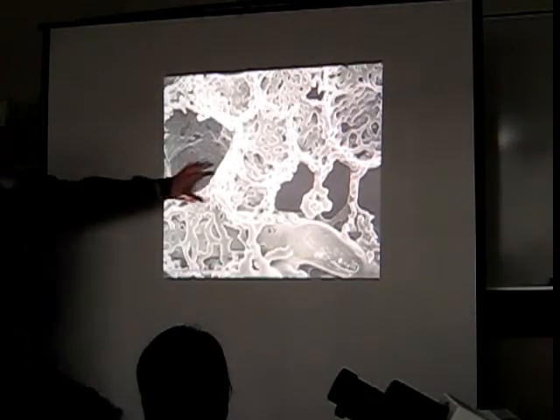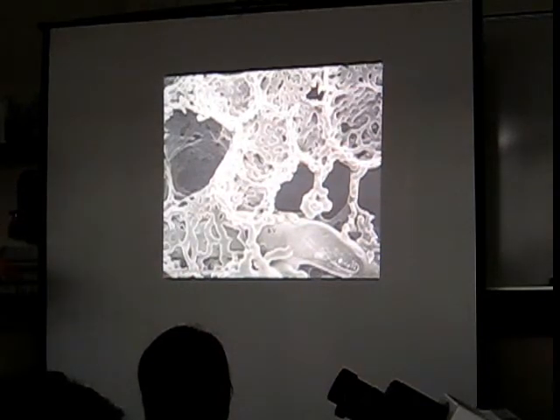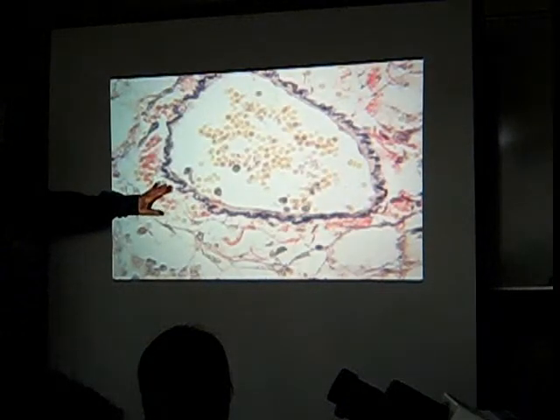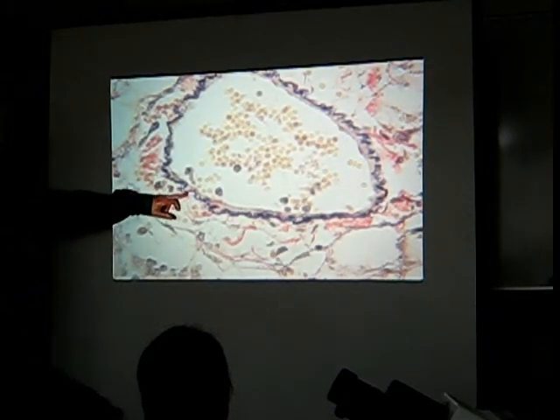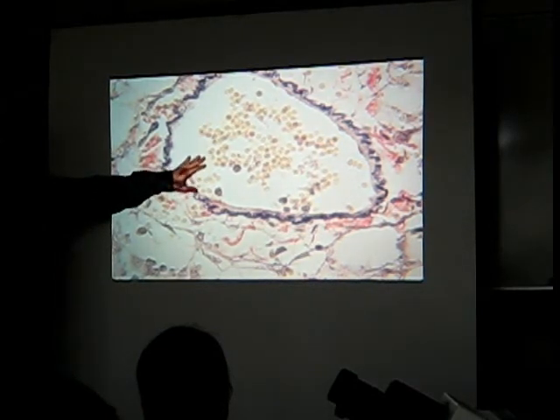Arterioles down to the capillary network surrounding each of these alveoli. Then those drain venules into the pulmonary vein. No internal, just an external elastic lamina, thin wall, carries oxygenated blood.